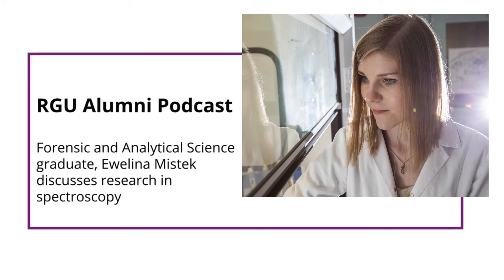Ewelina, maybe we could begin with a layman's definition of Raman spectroscopy and something about how practically it works. Sure. So actually, we are working with different vibrational spectroscopic techniques. That's Raman spectroscopy as well as attenuated total reflection Fourier transform infrared spectroscopy, known also as ATR FTIR spectroscopy. Those techniques apply light, more specifically photons of light, in order to vibrate the molecules within the materials. And they give a very unique characterization of the sample based on the chemical and biochemical composition of the material that is being analyzed.